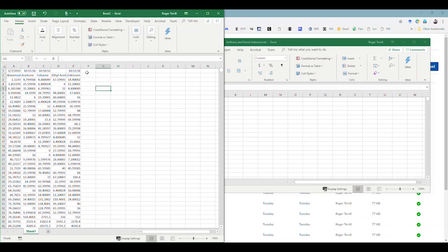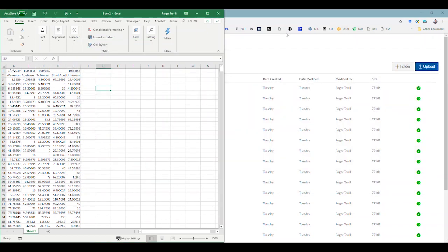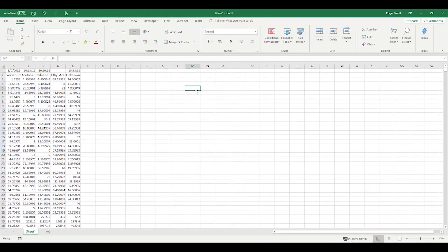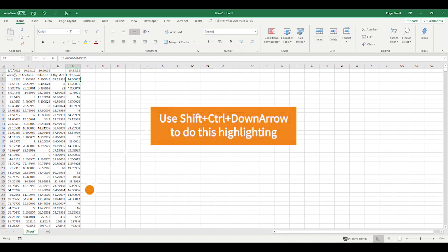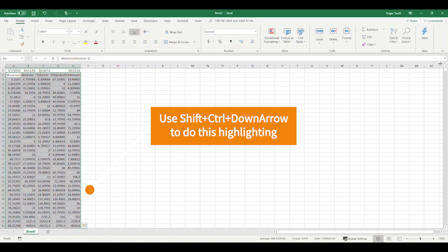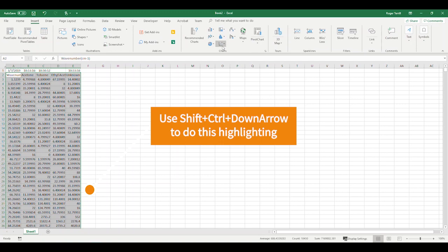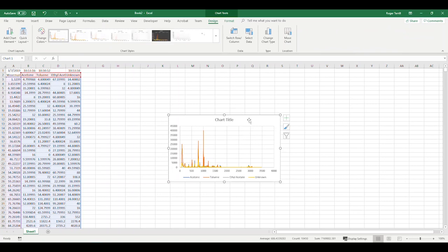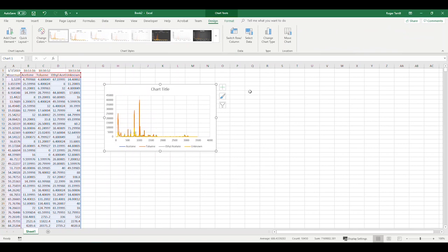So now, let's go ahead and make a graph of these guys. You'll notice that I trashed the wave number column from these guys because they're all the same. It generates the same wave number column every time. So to make a graph of this, it's actually possible that I could do something clever like this, basically highlight the whole mess. And let's go ahead and make a graph of these guys. We can do Insert, Charts, Scatter straight lines. Let's see what this guy looks like. Oh yeah, that works. There we go. Cool. So that's actually a good chart to start with here.